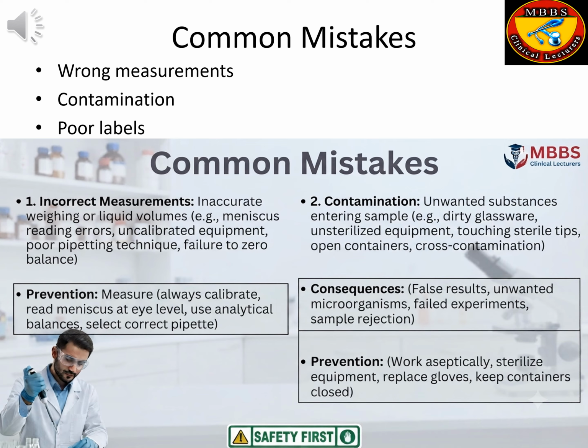2. Contamination. Contamination occurs when unwanted substances enter a sample or solution. Sources of contamination include dirty glassware, unsterilized equipment, touching sterile pipette tips, leaving containers open, cross-contamination between samples.